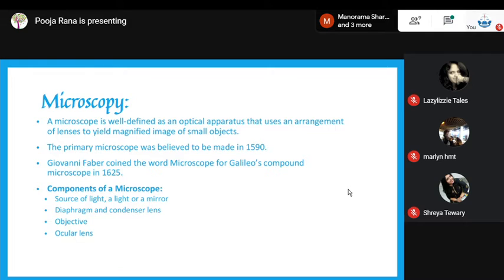All right. Now, talking about the components of a microscope. So all the contemporary optical microscopes are aimed at observing the samples by transmitted light and have a similar uncomplicated apparatus of light direction. And here the components of that apparatus are listed over here. These are listed in the order in which the light travels through them.